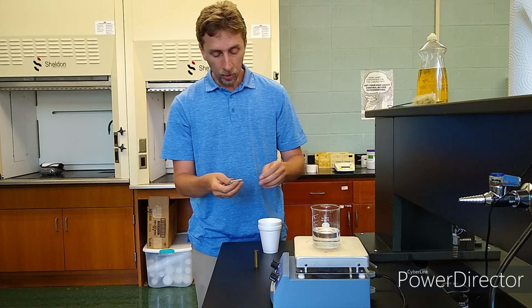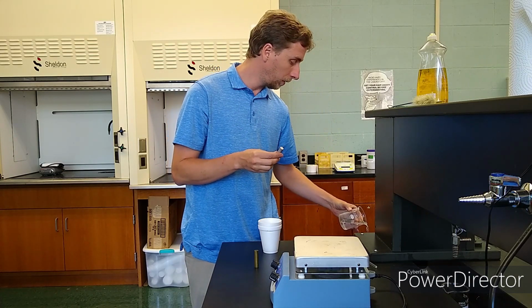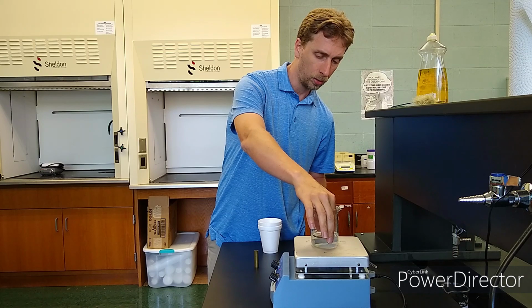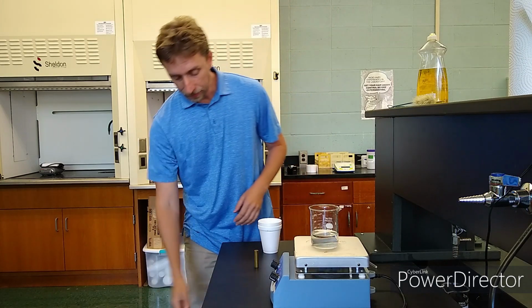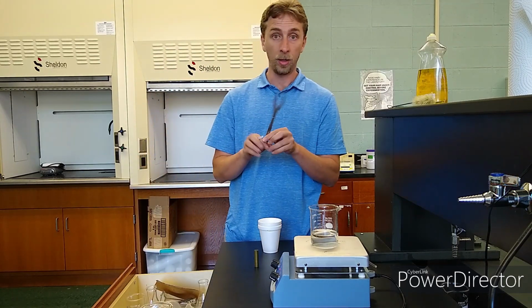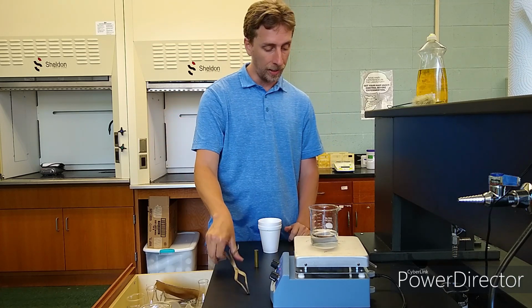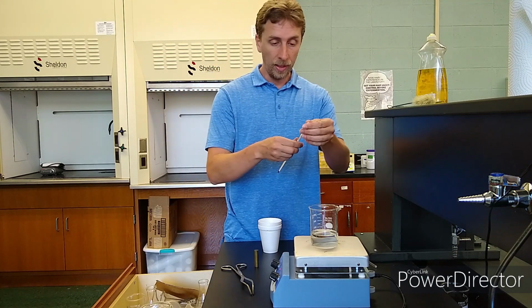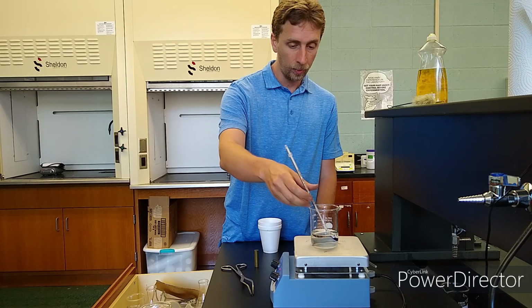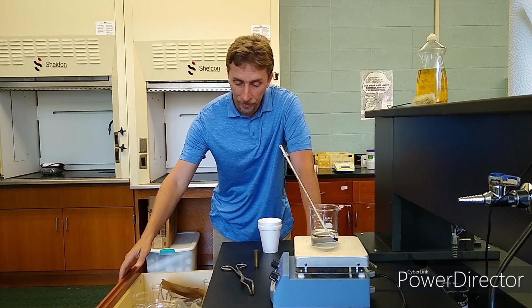It shouldn't take too long to boil because I didn't use a lot of water. You just need enough to submerge the aluminum completely. So I'm going to put that in there gently. It's not hot yet, of course. From here on out I'm going to move it with a nice pair of tongs for moving the hot stuff. I'm going to have to get this metal out of here after it gets up to a nice boiling hot temperature, which everyone should know is 100 degrees Celsius for boiling water. I'm going to put a thermometer in there just to confirm the temperature of boiling water.